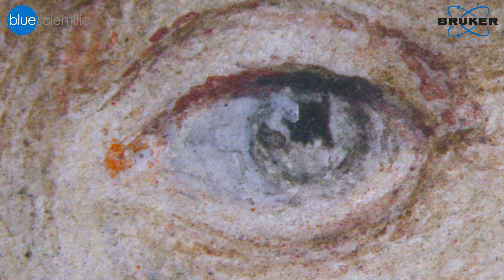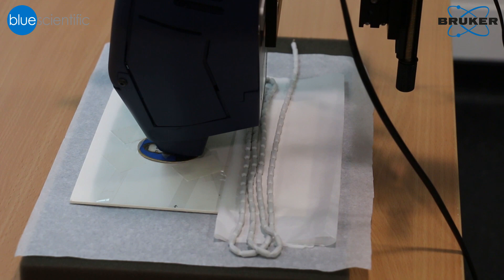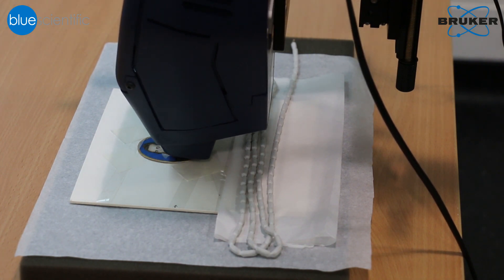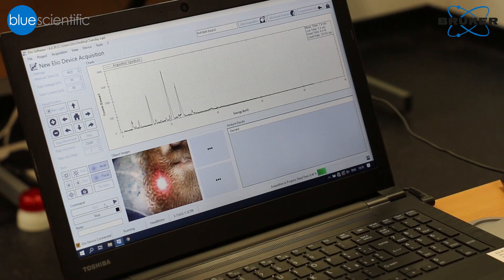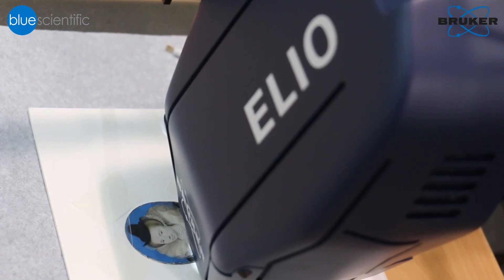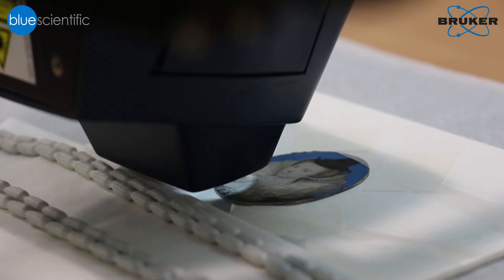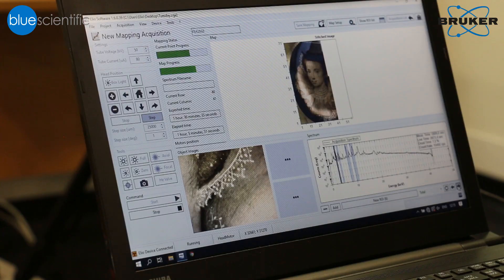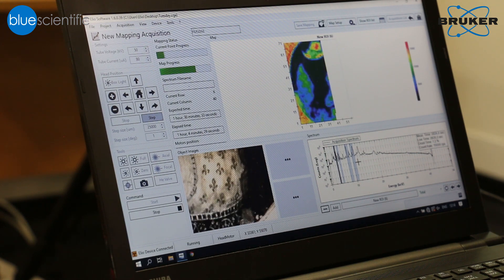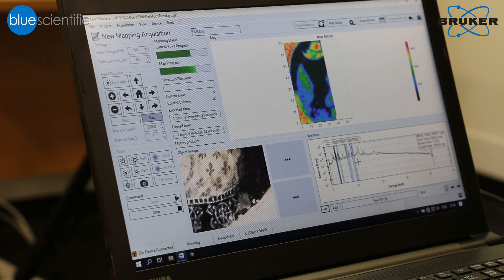We've been using a range of spectroscopic methods to investigate the materials composition of the miniatures, specifically the pigments used by the artist. One of the methods we've been using a lot is XRF — X-ray fluorescence spectroscopy — which gives the elemental composition of the pigments. What we're doing today with the instrument is performing an XRF scan, which means we get an XRF spectrum at every single point on the miniature, about every millimetre or so. That's really great because we can not only identify the elemental composition of various points but also get maps of the elements.